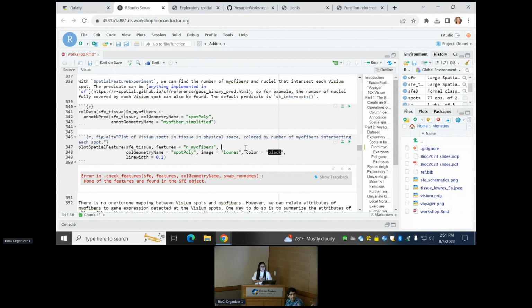Yeah, someone has done one. That's sort of why I want to emphasize in my paper that I extend SCE and SPE, because when people have existing implementations of other spatial analyses, or non-spatial or interactive ones, and they use SCE, then I can just use those instead of reinventing the wheel.